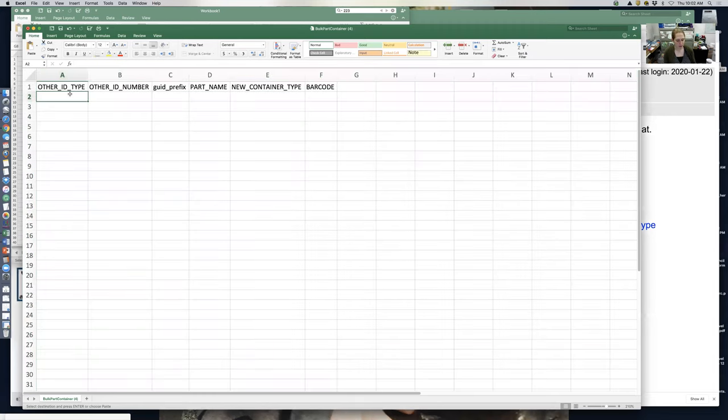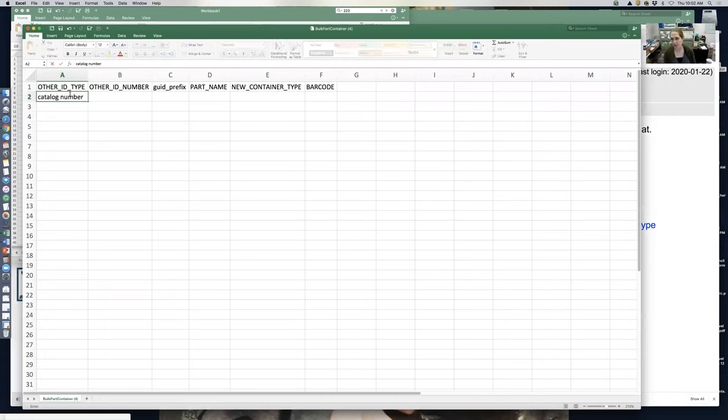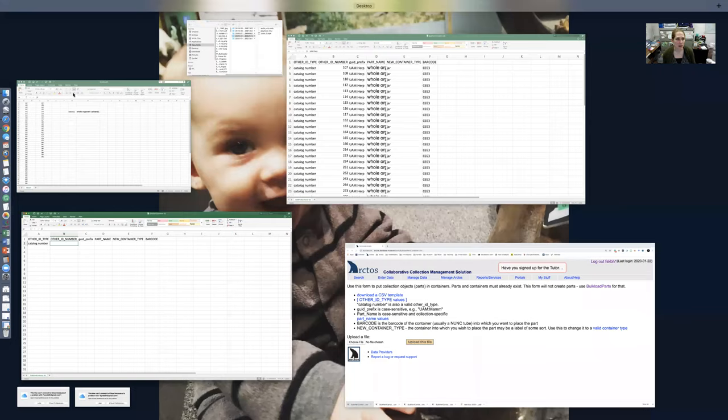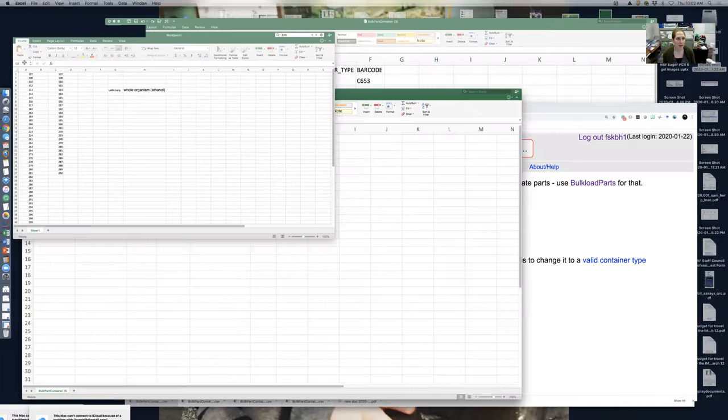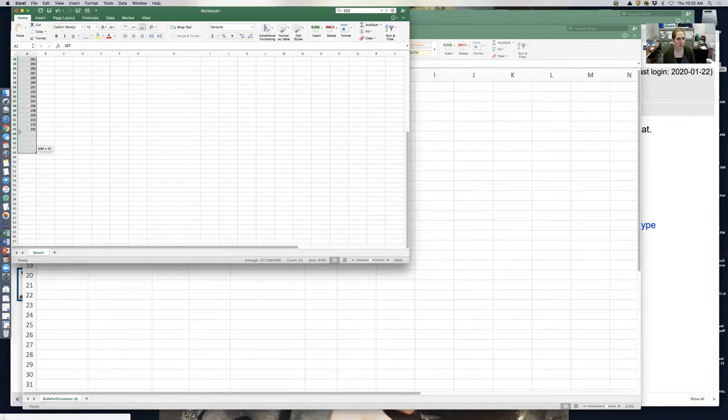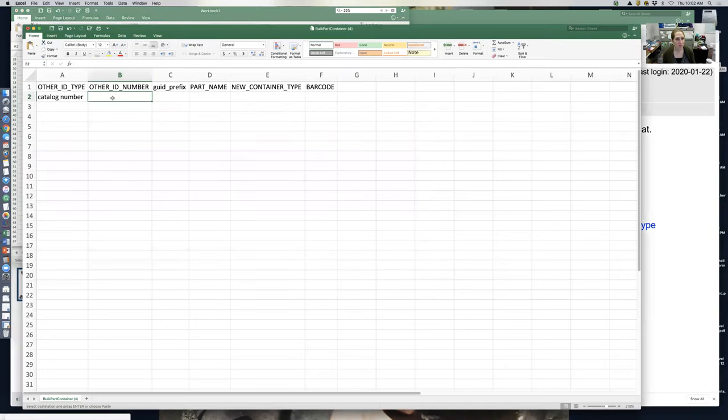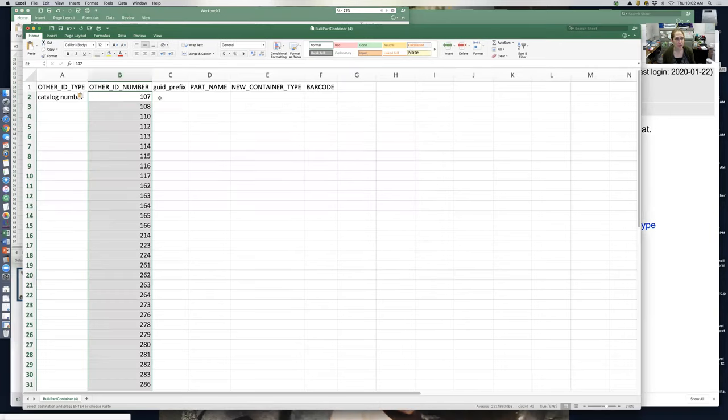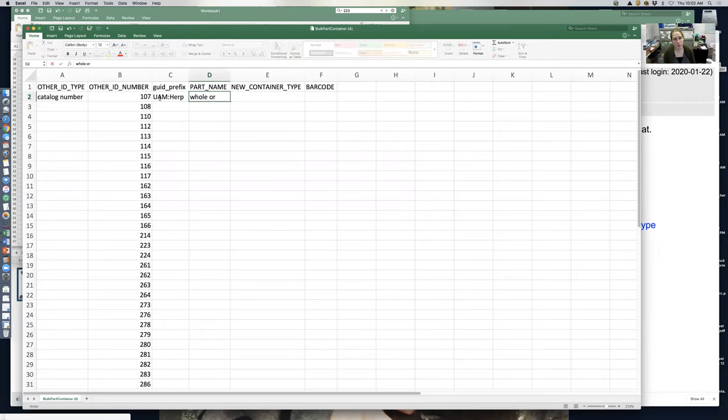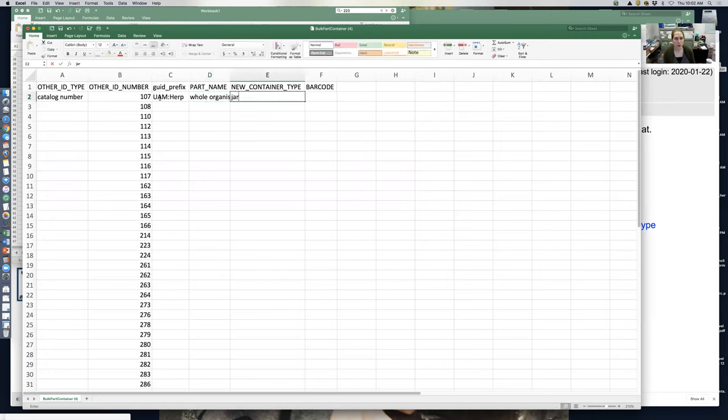What I want is other catalog type, so I'll do catalog number since that's what I have. It can be original ID number or whatever you're working with. I already made a list of them, so I'll copy them. I need other ID number; the prefix is UAMHER. Part name is whole organism ethanol, container type is jar, and the barcode we'll scan in is C53.